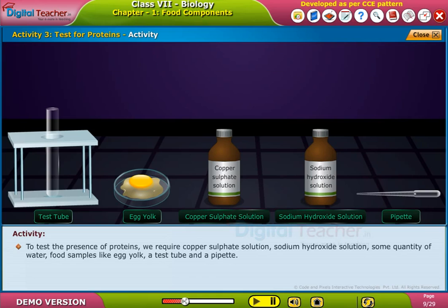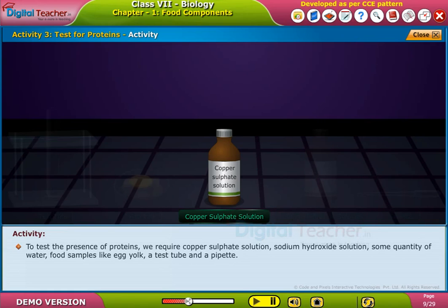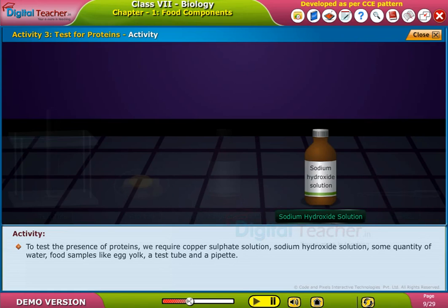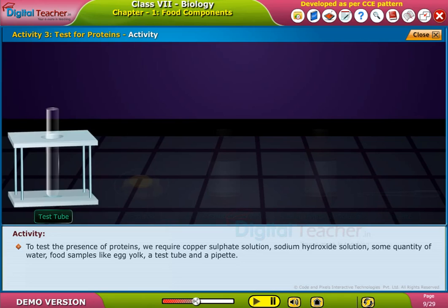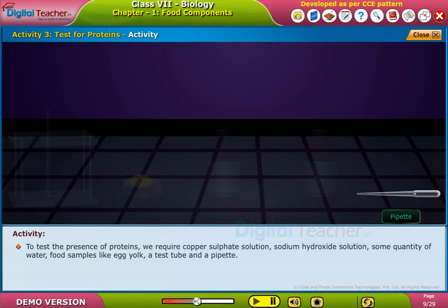To test the presence of proteins, we require copper sulphate solution, sodium hydroxide solution, some quantity of water, food samples like egg yolk, a test tube, and a pipette.